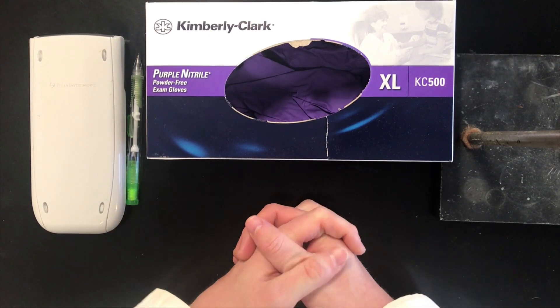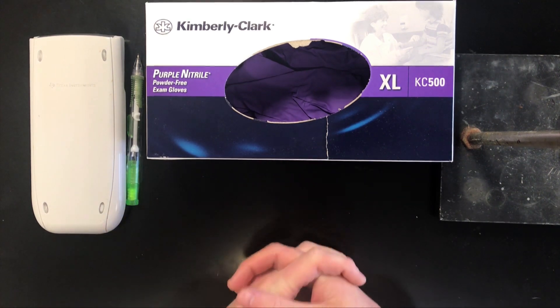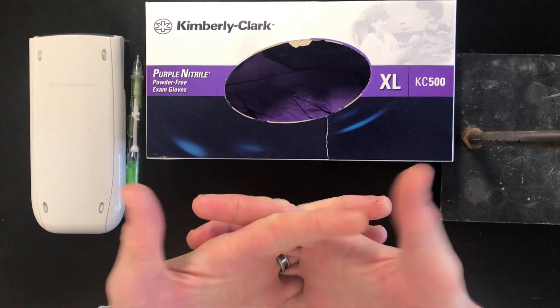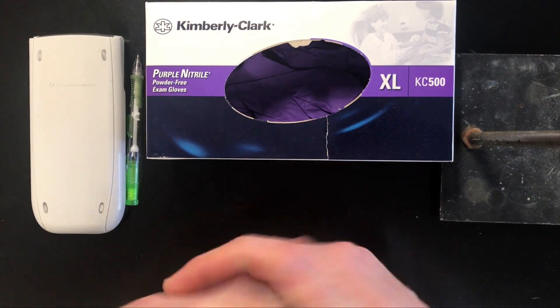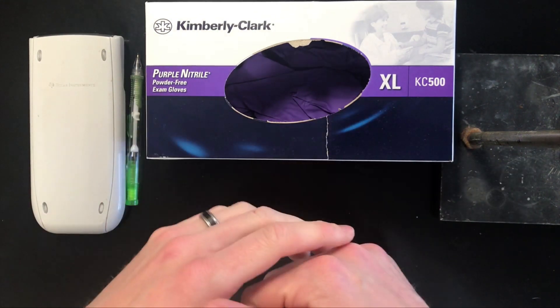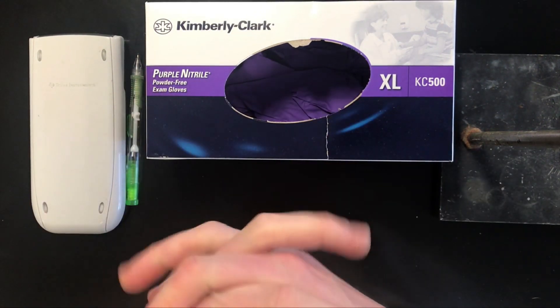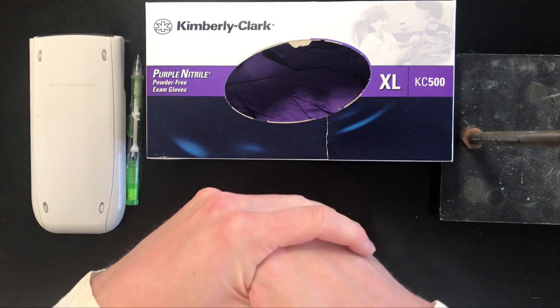Hello everyone, Dr. Evans here talking about proper glove hygiene. The first thing to say about gloves is that they are one of the most important pieces of PPE, arguably the most important, because you'll be using your hands to manipulate containers throughout laboratory experiments, and your hands really get closer to the chemicals than anything else. So PPE related to the hands is critical.